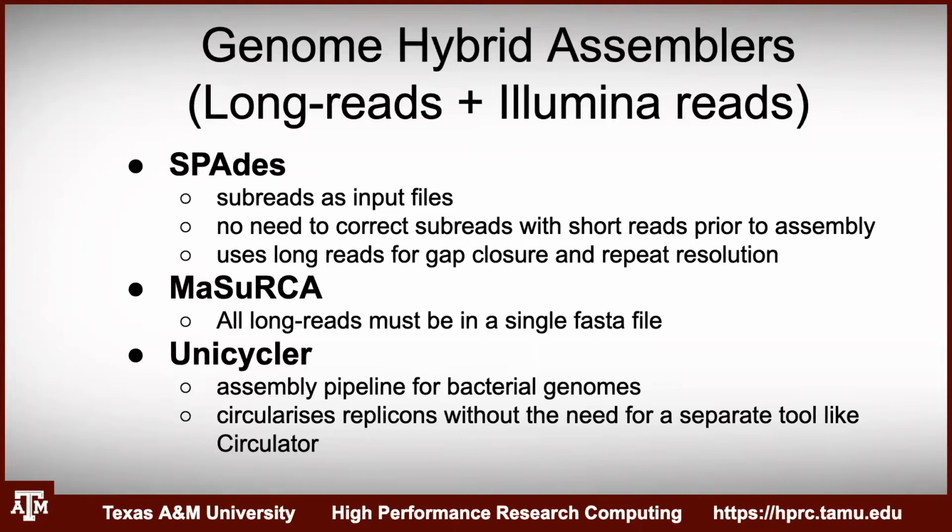Things that are highly repetitive are difficult for short reads to resolve, right? If you have a repetitive sequence that's 1 KB or 2 KB, and you get a read from the middle of that sequence, and that repetitive unit occurs within the genome 100, 200, 1,000 times, the assembler can't tell which unit that short read actually belongs to, because it's the same from each repetitive element.